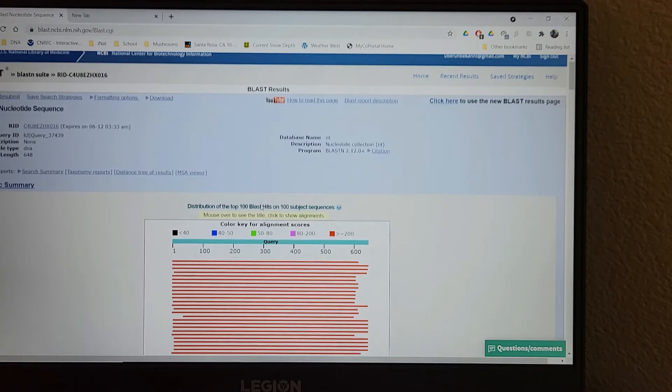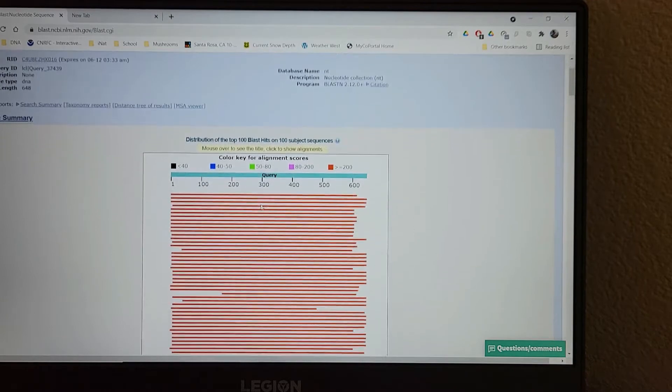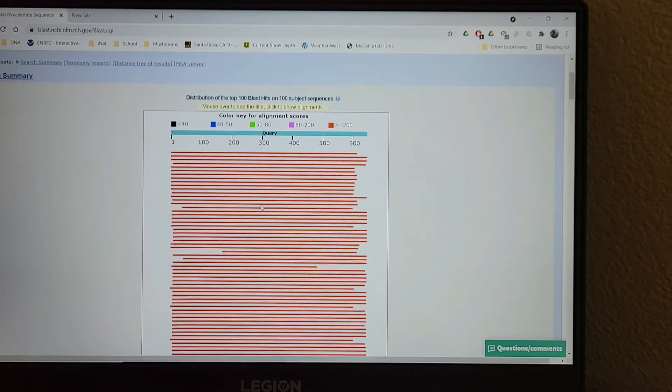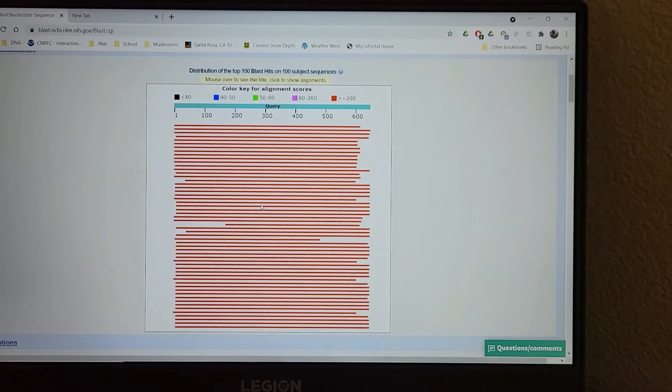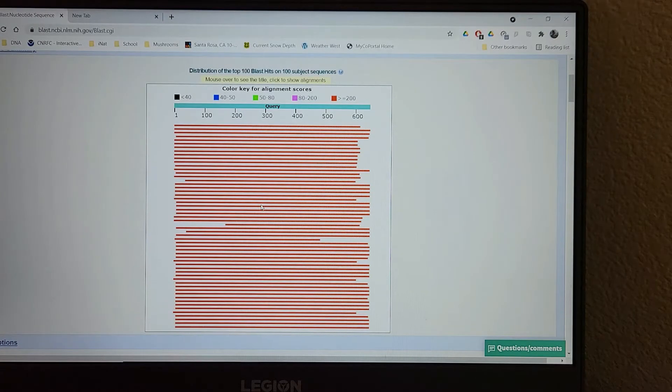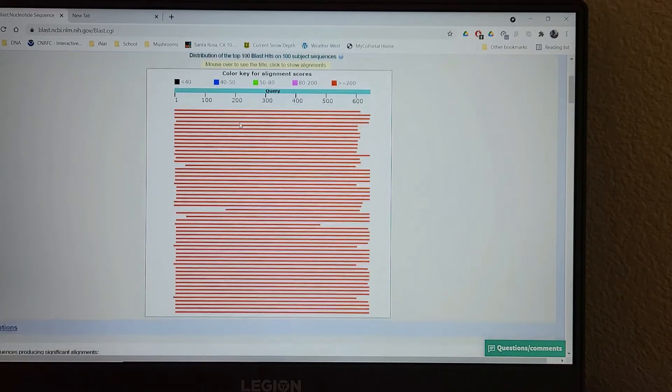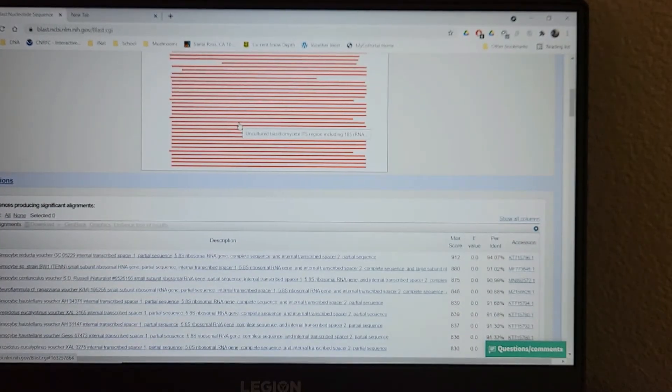So the first thing we see is our alignment scores. So this basically just shows how well your group of DNA overlaps with all the other sequences. So it looks like all the top hits are really well aligned. They all line up nicely. Then we're going to look over here.